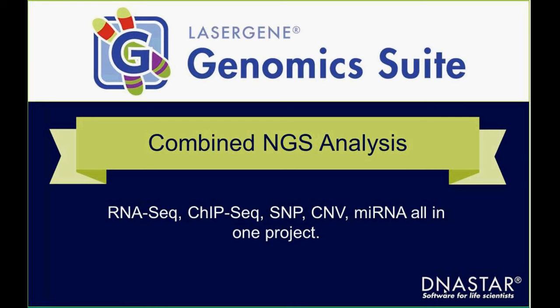And there are several different examples of when you may have data from different sources, but then you want to co-analyze them together. So we streamline that process tremendously, and it's going to be a pretty exciting webinar just to show how we can take very large data sets from different sources and do a combined analysis on them.